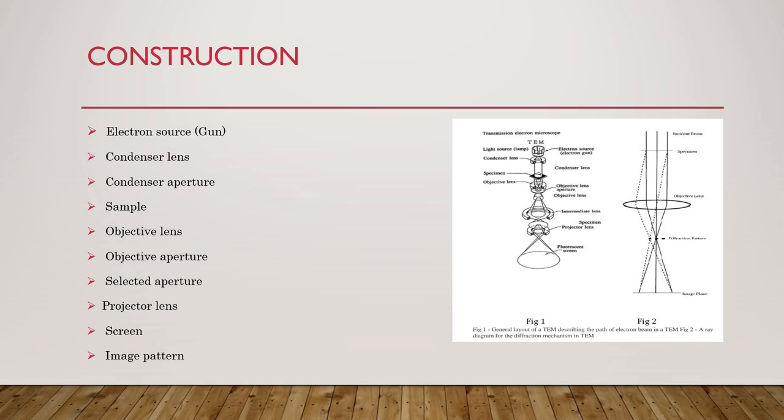A collection of electrons occurs in the space between the filament tip and cap, which is called a space charge. Those electrons at the bottom of the space charge can exit the gun area through the small hole that is less than 1 mm in the Wehnelt cap and then move down the column to be later used in imaging.